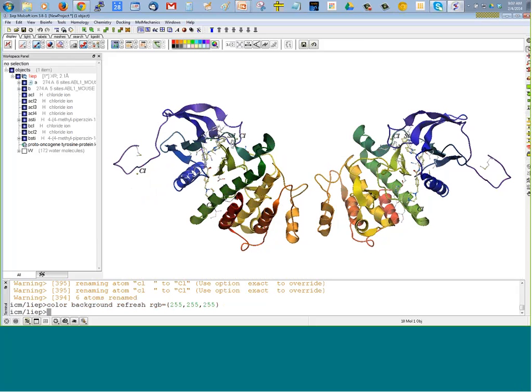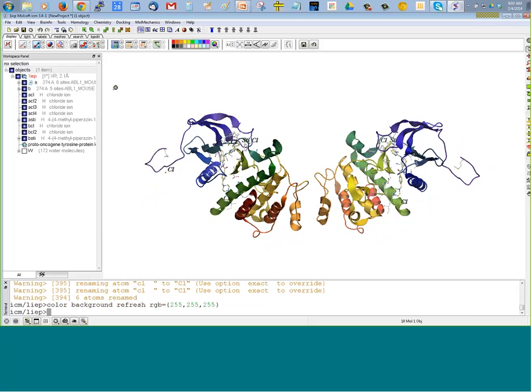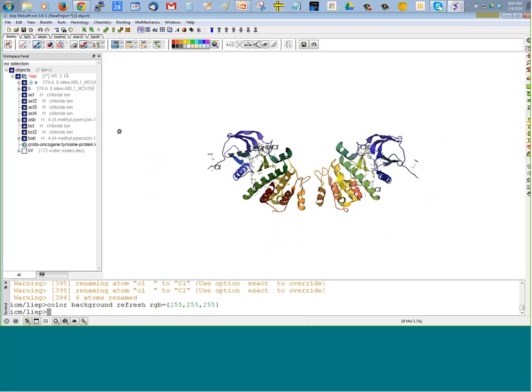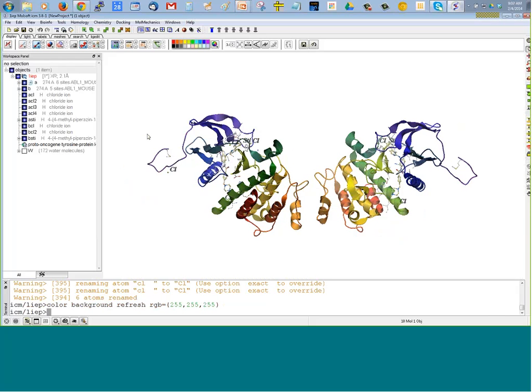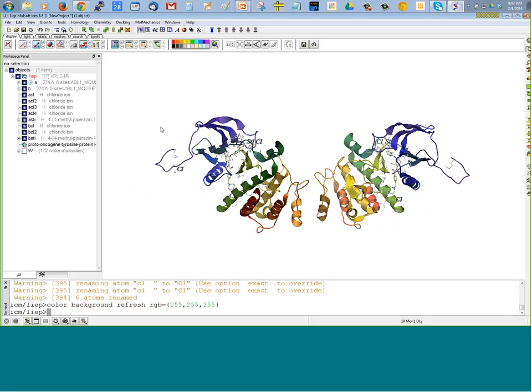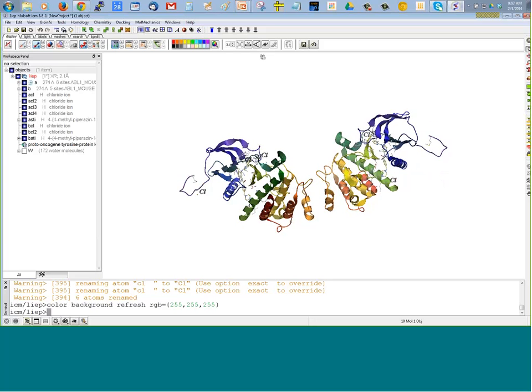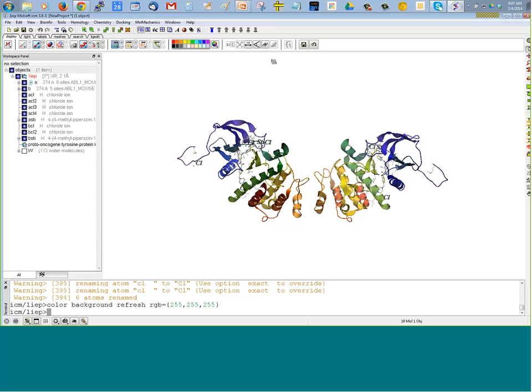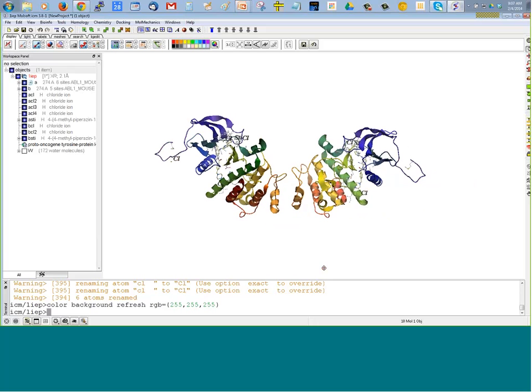So hopefully in WebEx you can see that the mouse button changes here from a rotation, and if I move it along a little bit, this panel here going down here is devoted to being able to zoom in and out. Or alternatively, you can use the middle mouse button to do that. Likewise, the top of the screen is devoted to Z-axis rotation, and the bottom section of the screen is devoted to translation, so you can move the structure around the screen.